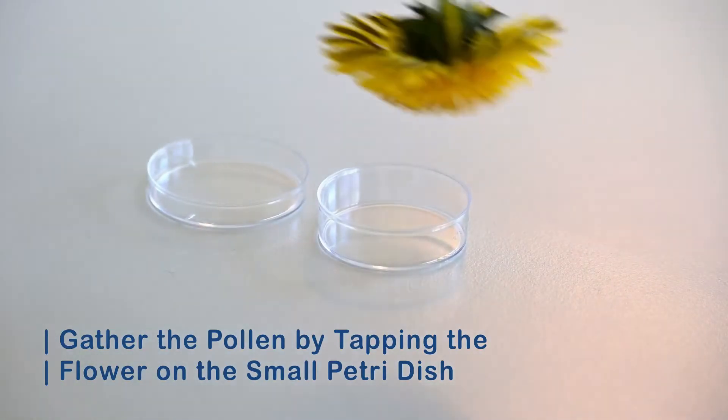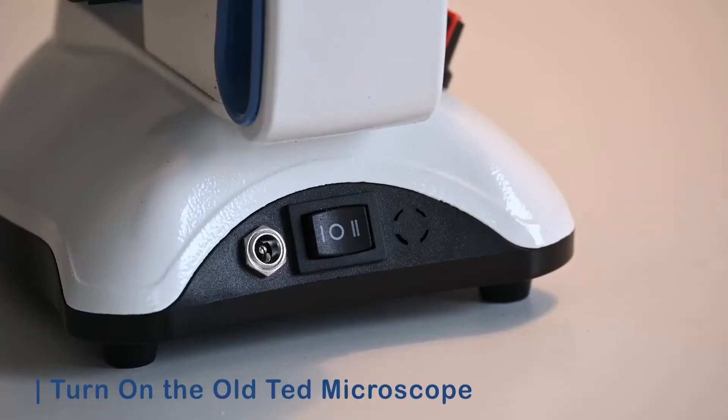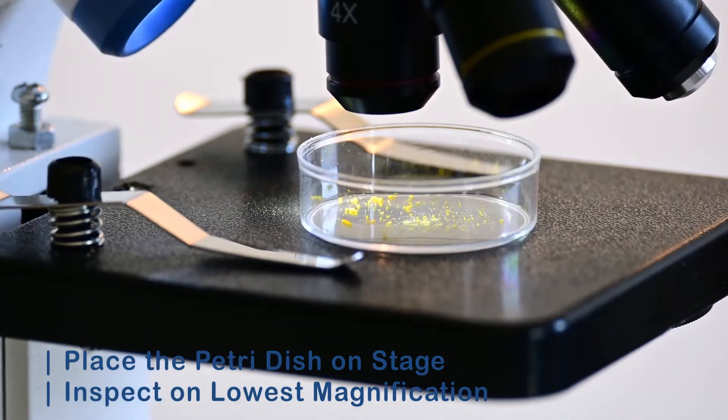When you find a flower, take the small petri dish and tap the flower against the bottom of the dish. Then turn on the old Ted microscope and inspect the petri dish on the lowest magnification.